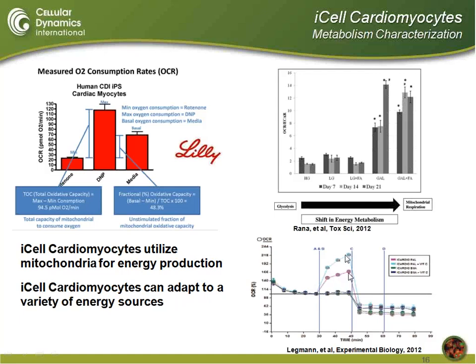as linked by beta oxidation, which they showed here at C, where they injected a compound to block the beta oxidation specifically. Now, when they incubated the cells in an antioxidant, they showed that they were able to actually increase the oxygen consumption with fatty acids. And again, that was blocked, once again, with the compound to block beta oxidation.